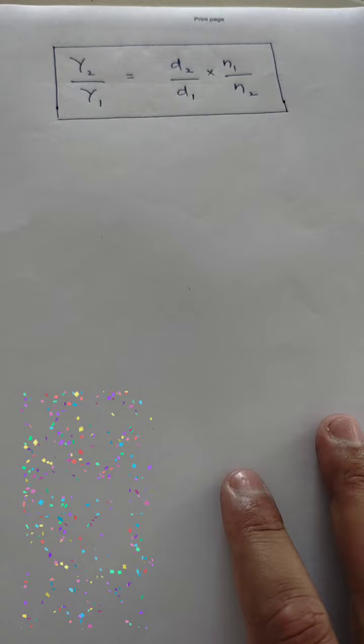Bismillahirrahmanirrahim. So, dear students, today we'll be talking about another approach regarding the determination of surface tension in the lab.